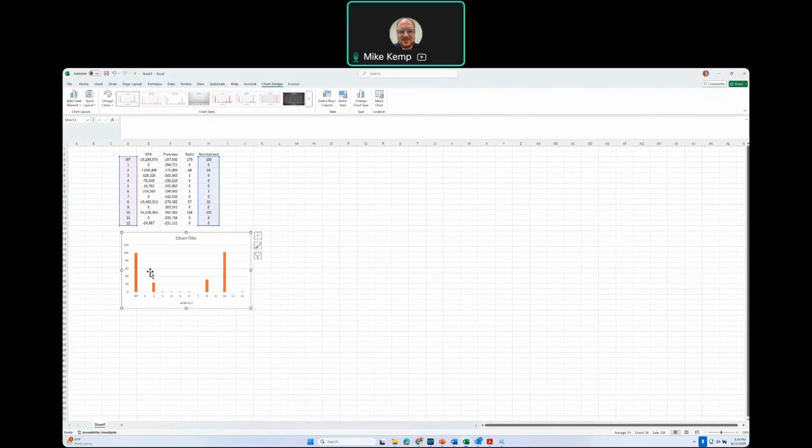You never want a graph without the x and y-axis labeled, or else how do people know what you're trying to show them? So again, the x-axis is the cell line.